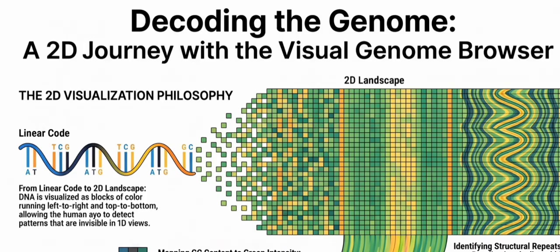It does, but the feature that truly blew my mind in the notes is the mismatches function. It basically takes this concept of biological flexibility and amplifies it. You can literally paste a massive sequence and tell the software, find this pattern, but I'm giving you permission to make a specific number of errors. The mismatch allowance is basically acknowledging the reality of evolutionary time. Binding motifs or ancient genomic structures aren't uniformly identical across the 3 billion bases. They possess a consensus sequence, like an ideal average version, but in reality they drift and degrade. Over time, yeah. The mismatch feature allows you to find the distant cousins of your sequence, not just the identical twins. The sources provided a beautiful example of this involving telomeres.